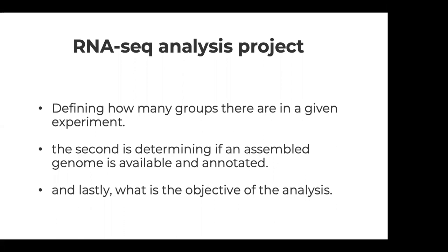As I was telling you before, the genome is very important because when we have raw reads in FASTQ files, we need to align them to a reference genome before we can study the genes or isoform expression. Why? Because for the genome that you have sequenced, you don't know anything about it. And to do a comparative analysis, it would be great to do it with a known genome where you know the positions of the exons and the positions of the genes. That helps us to reduce the error.